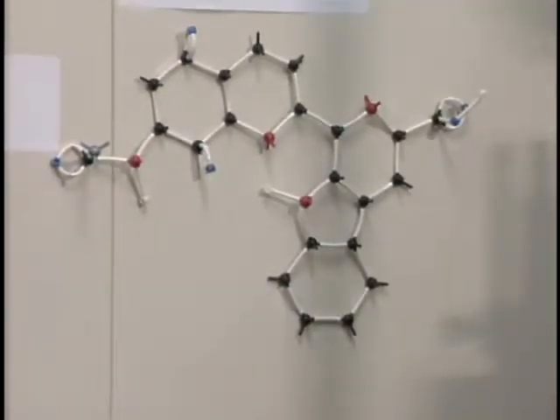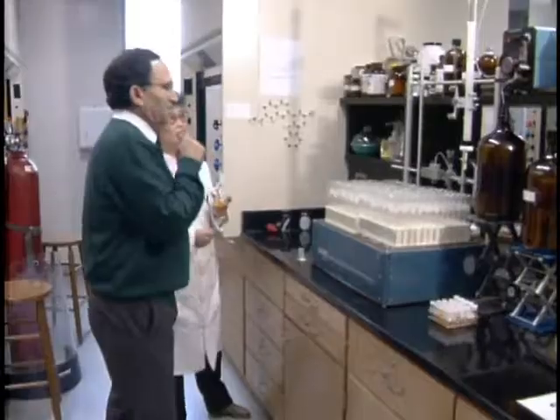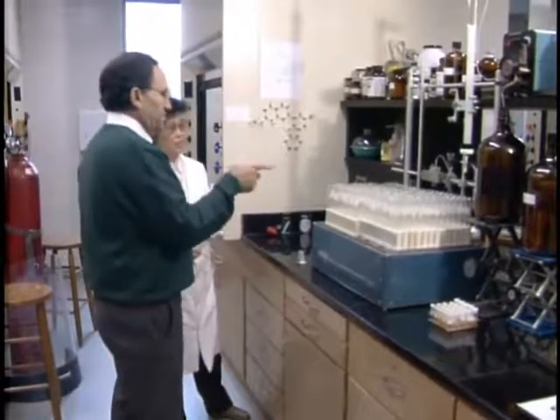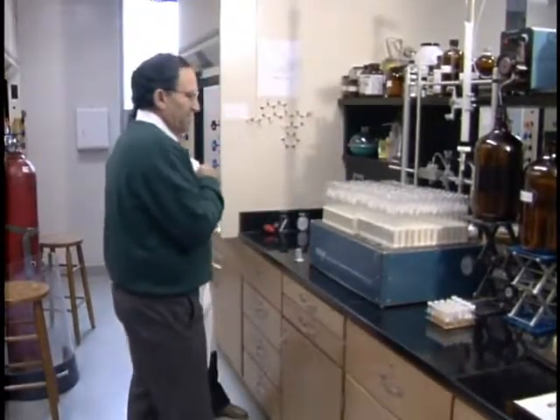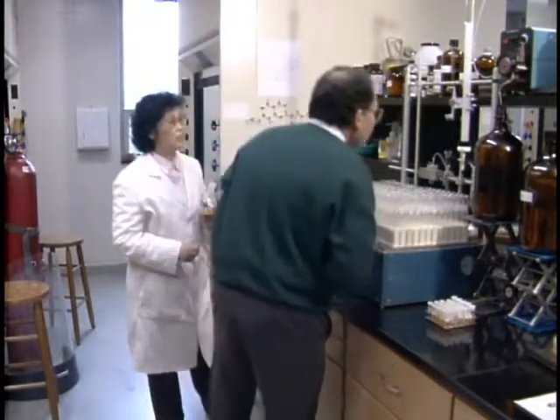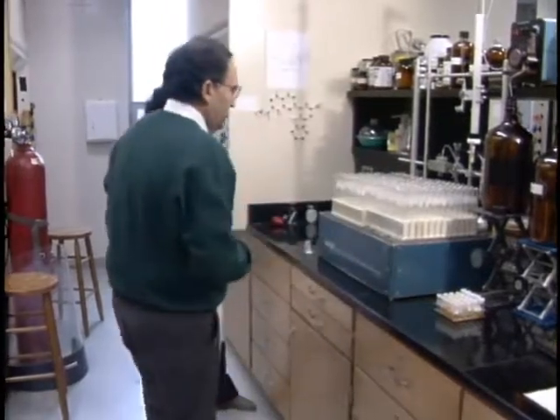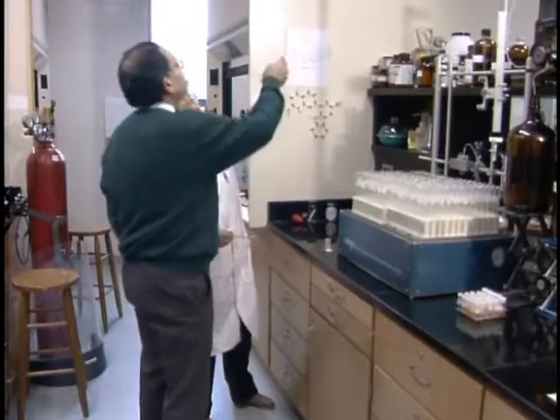Copy of that model paper. That'll help you out. You can do that in the graphics. And you want to use this for separation of what? Okay, we're shooting now. After that, we will separate it by this one. Now right now you're separating. That's suffix. Okay. And this comes in. That's the second fraction. Now the crystal that we have here is this the what?